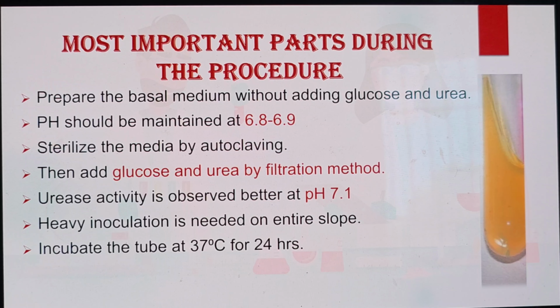Most important parts during the procedure. Prepare the basal media without adding glucose and urea. pH should be maintained at 6.8 to 6.9. Sterilize the media by autoclaving, then add glucose and urea by filtration method.